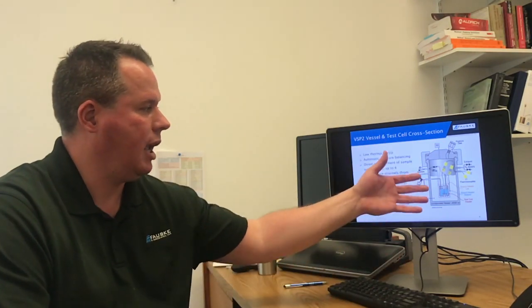In order to get the low thermal inertia test cell, it's very lightweight, so it's not able to withstand high pressures. So we actually add nitrogen outside the test cell to keep the pressure differential low, keeping the test cell intact. The instrument can measure temperatures from as low as -70°C up to 1,000 degrees Celsius.